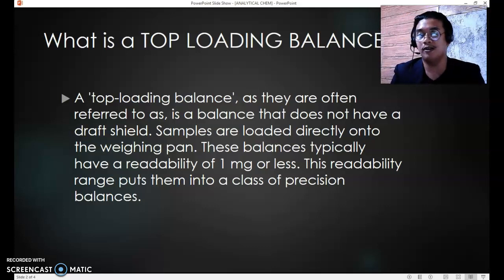Samples are loaded directly onto the weighing pan. These balances typically have a readability of one milligram or less. This readability range puts them into a class of precision balances.